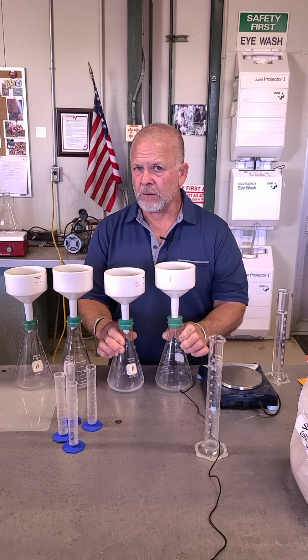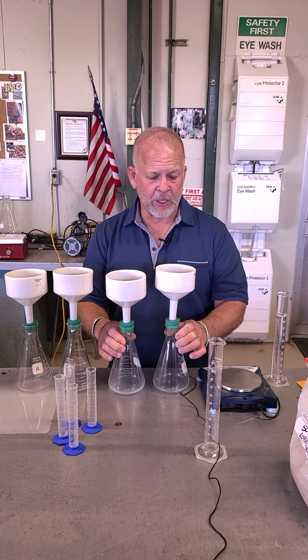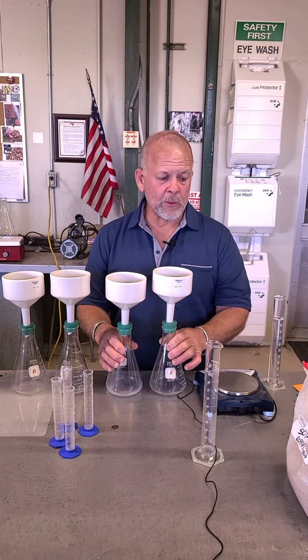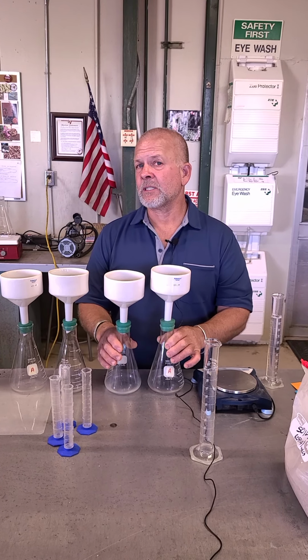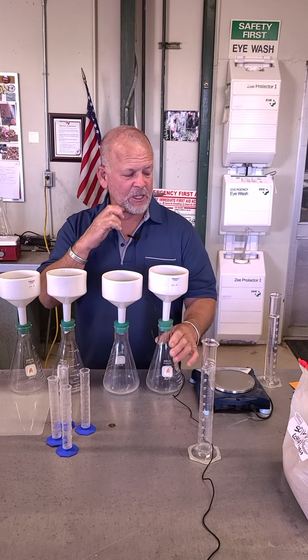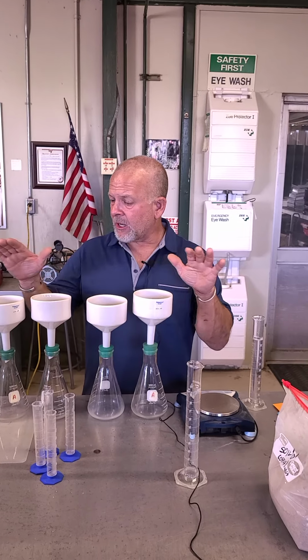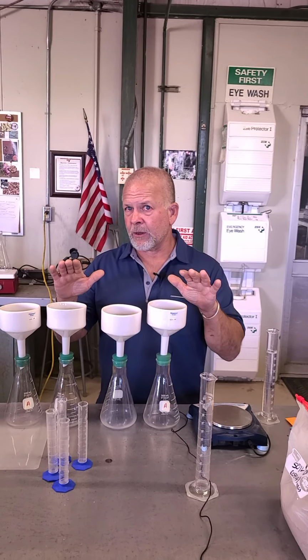So each soil, and remember the first one here, soil A, was a loam. Soil B was a loamy sand, and soil C is a silty clay loam. I'll put that on your data sheet so you don't forget that. And I've got all my treatments labeled 1, 2, 3, 4 here.